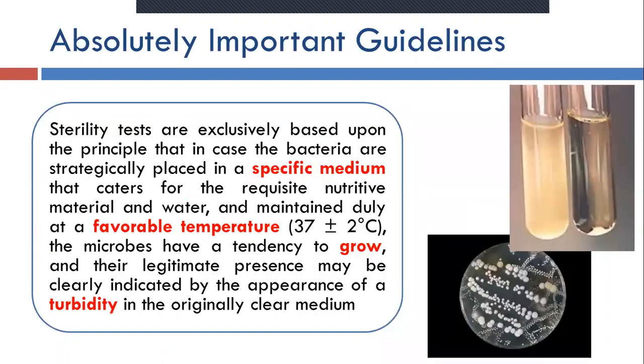Sterility tests are exclusively based upon the principle that if bacteria are placed in a specific medium that provides the requisite nutritive material and water, and maintained at a favorable temperature, usually 37 plus or minus 2 degrees centigrade, the microbes have the tendency to grow, and their presence may be clearly indicated by turbidity in the original clear medium.